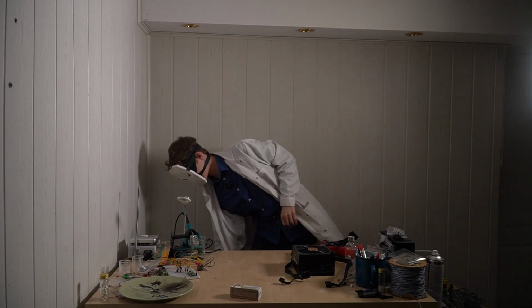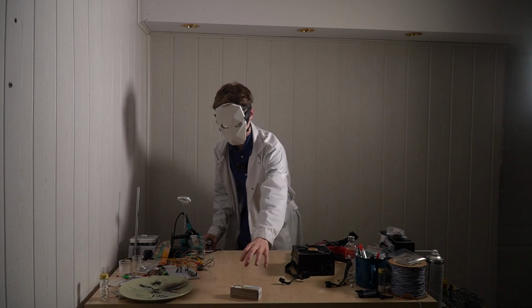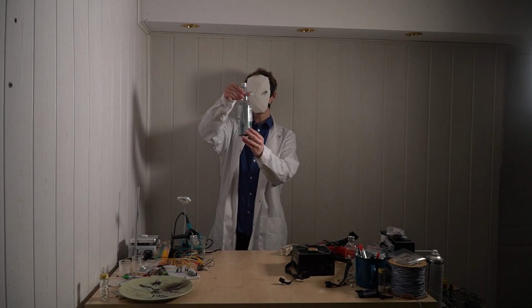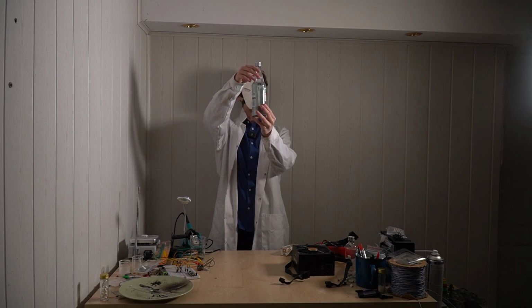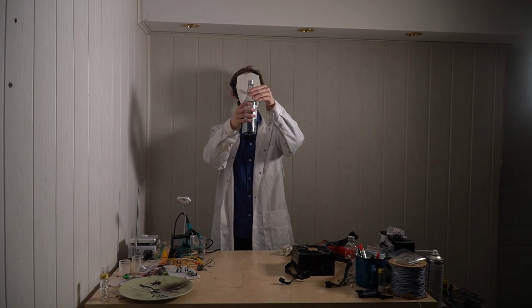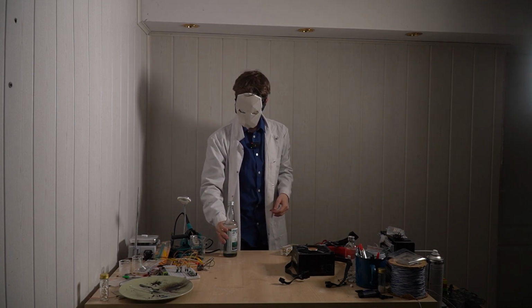But that said, sulfuric acid is done. Actually, this is the second time I'm recording it. The reason is because I've waited for days for those pH testing strips to arrive. And here it is. It's even clearer now. Yeah, I know, it's a comical bottle. The point is, it's really, really clear now. There's a lot of electrode junk at the bottom. And I think this might genuinely be some relatively clean sulfuric acid. So let's test it out, shall we?